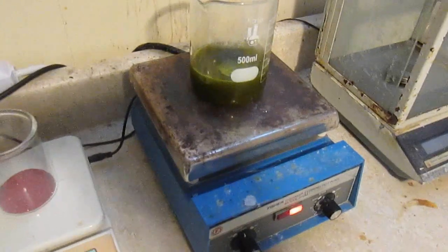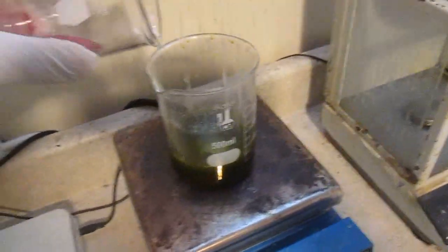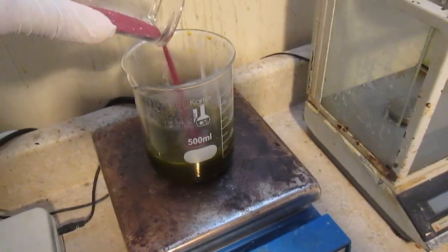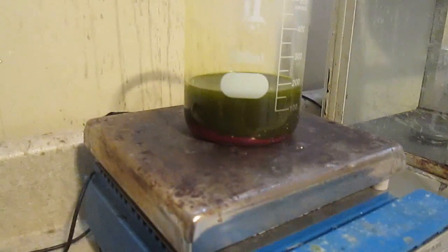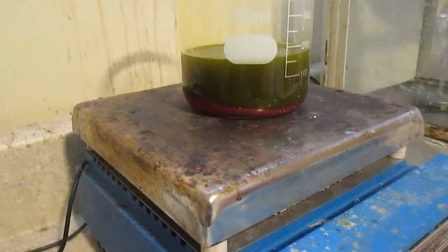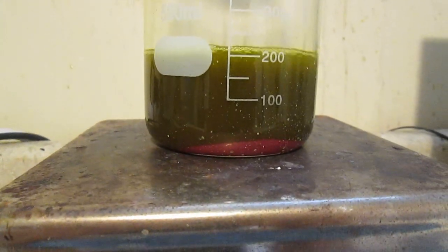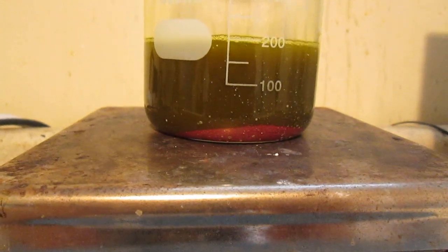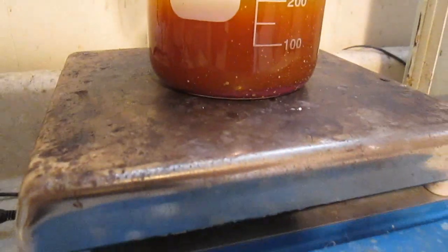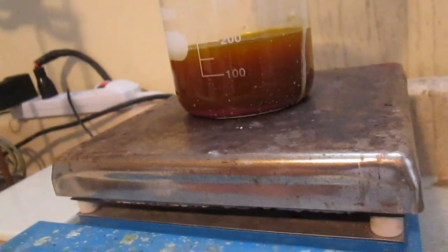Now we're ready to add the cinnabar. We can see a precipitate immediately forming at the bottom, and by the time it's done reacting, the precipitate should be gone. We're going to keep the stirring and heat on and come back in a while. A few minutes later the precipitate is gone — it's hot. After about 30 minutes you don't see much precipitate anymore.